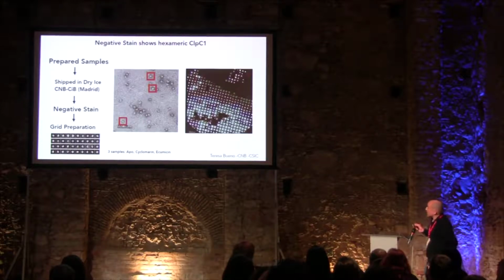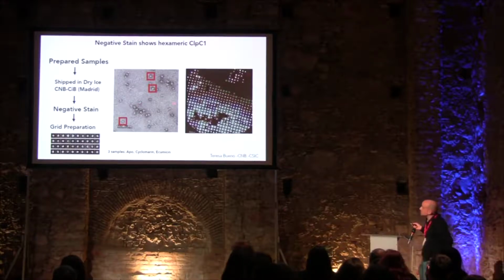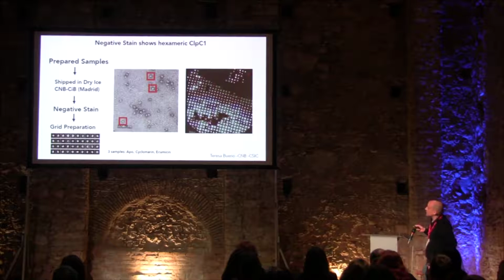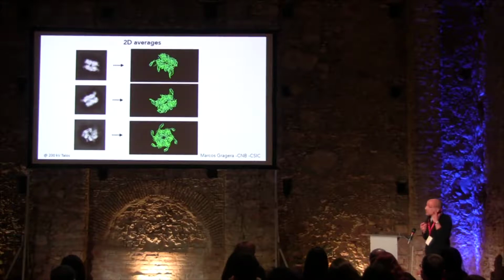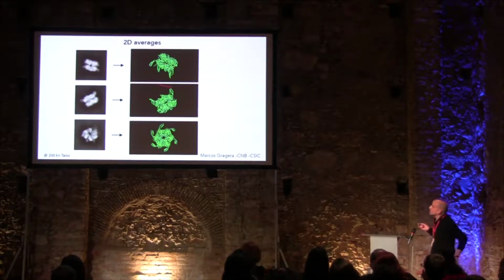So, going back to what's important, they also did negative stain in Spain, so you can see these micrographs there. The grids were done by Teresa Bueno, and then Marcos did the processing, and Marcos was extremely efficient. Basically, we had a talk by Skype. He said to me, Hugo, we have these 2D averages. Do you think it looks like your protein? Of course, this is compared with the literature to see what this thing should look like. And in fact, this is the original picture I sent to Marcos.